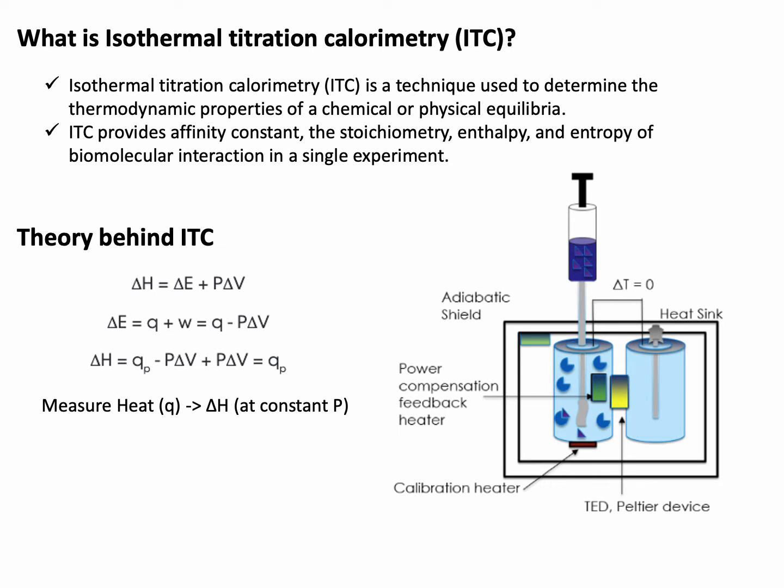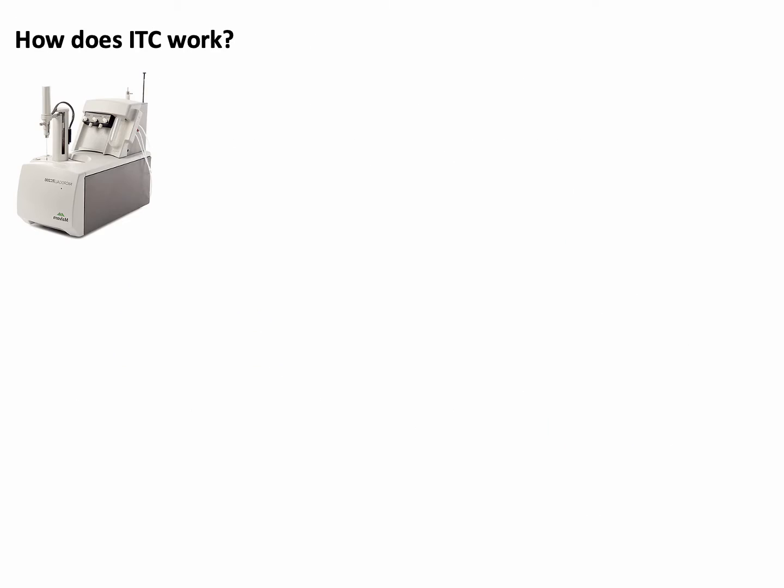Heat exchange is present in essentially every physiological process, making this technique particularly relevant in understanding binding equilibria and other molecular processes. Okay, so now let's see how it works.